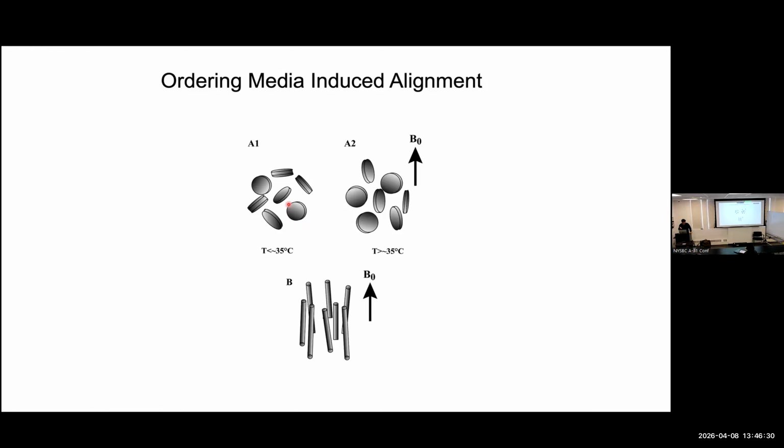Absolutely, they have magnetic susceptibility. They have aromatic moieties, they have a magnetic susceptibility tensor, which causes them to have a partial alignment. And then there's a liquid crystal phenomenon where they all add to each other and reinforce each other. But the underlying physical interaction is again the interaction. If you have a magnetic field, it's going to interact with the magnetic anisotropy, which is inherent to the sample.